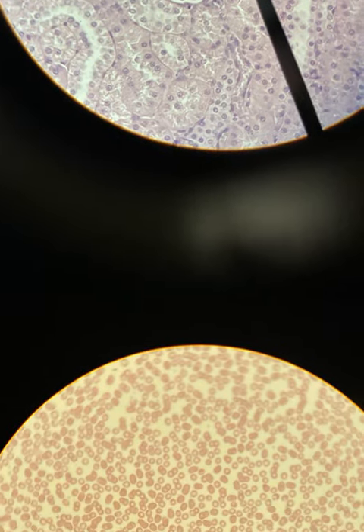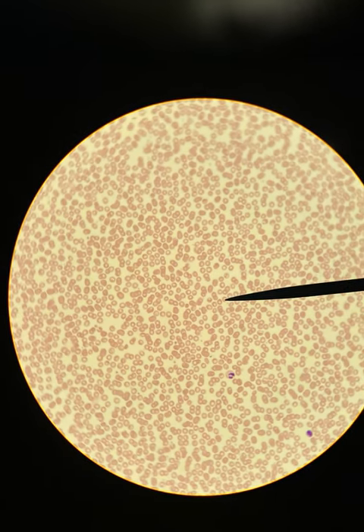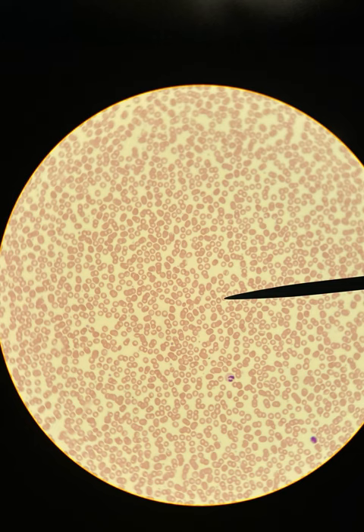Okay. And then here, this is a smear of blood, and blood is considered a connective tissue because it's connecting all throughout the body. And here we have three different things in the blood. We have these right here, and these are going to be erythrocytes. They make up most of this, and the erythrocytes are more commonly known as red blood cells, and their function is to transport oxygen and carbon dioxide from the lungs to the organs and out of the body, all that good stuff, right?